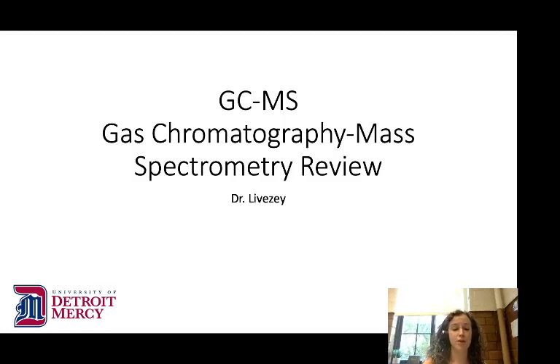In this second video, we're going to review a little bit about mass spectrometry. I think it's likely that NMR was reviewed pretty well in Organic Chemistry 1, and please feel free to look through those notes and use the tables provided on Blackboard. It's likely that mass spec might be a little less clear to you, so let's talk about that a little bit.